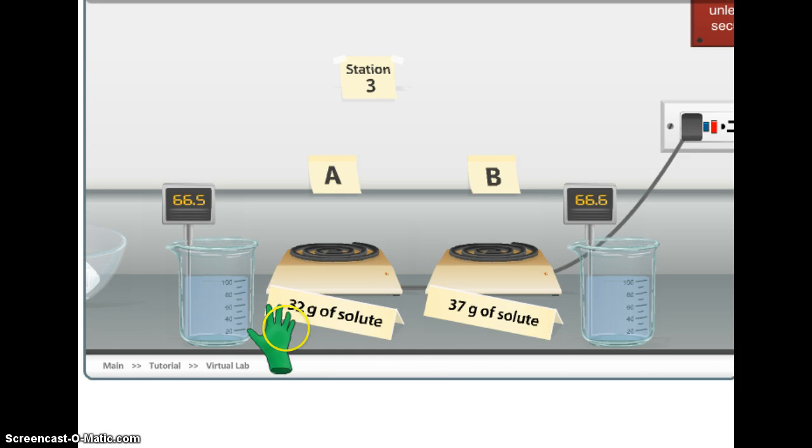And do you see any change yet? Nah, it still looks the same. It's gone down almost 15 degrees, but that's okay. We will keep letting it cool off. And we're going to continue to let it cool off some more. And what do you notice?